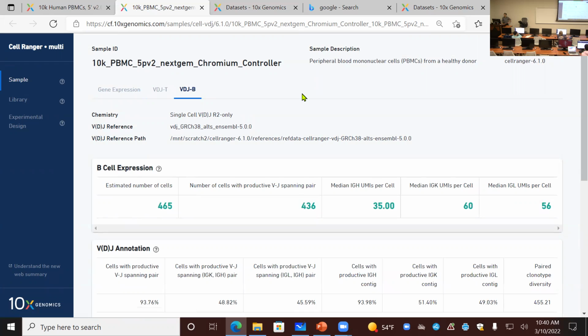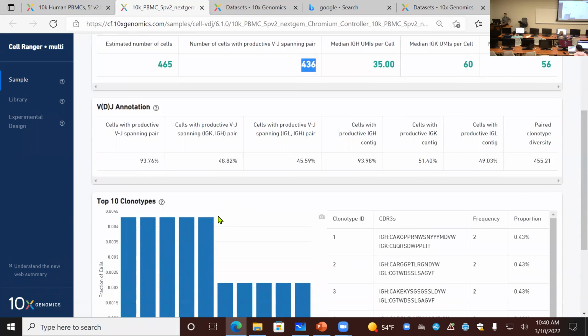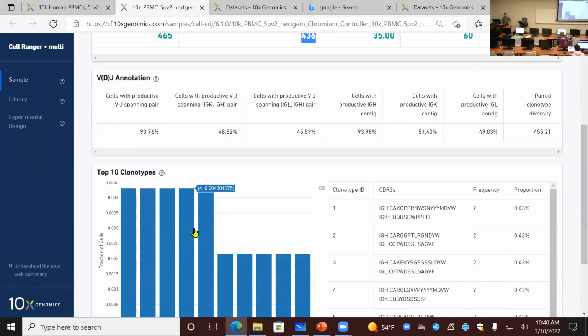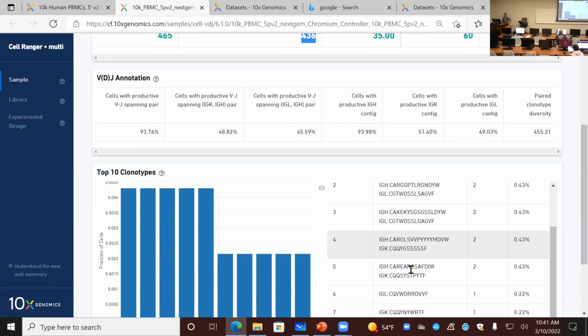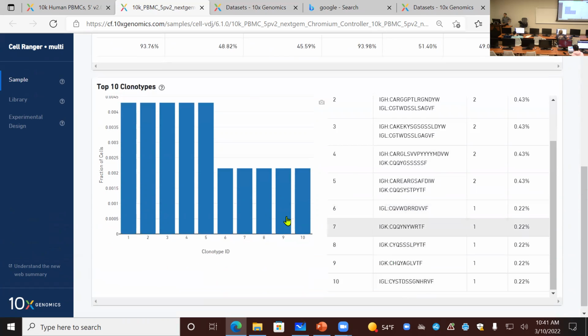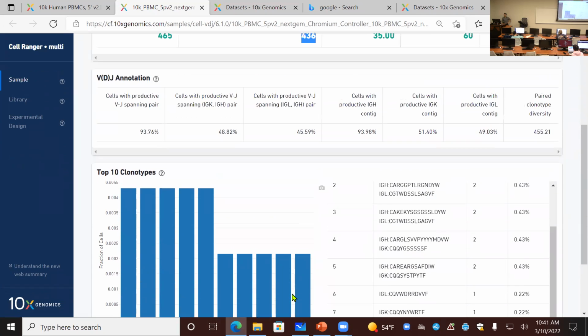They're very similar. You have B cells, and the number is small, it's only 436. You get information from the IgH, IgK sequence, antibody combinations from different immunoglobulin genes. But same idea, okay?